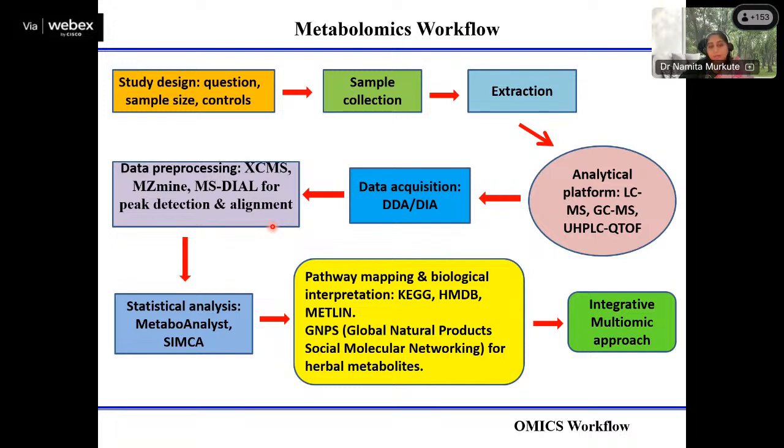It goes there and sees, and if it finds that this spectrum is related, with 100% or 99% resemblance to my alanine amino acid, then this may be the alanine amino acid. So it picks it from there and gives 100% confidence with alanine amino acid.